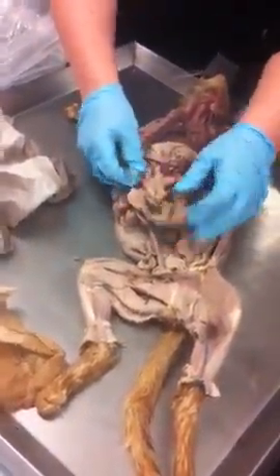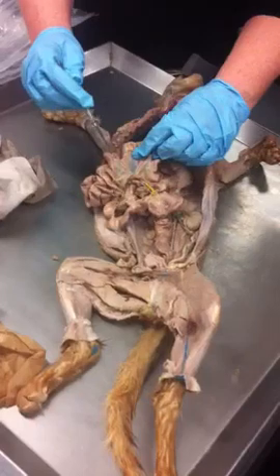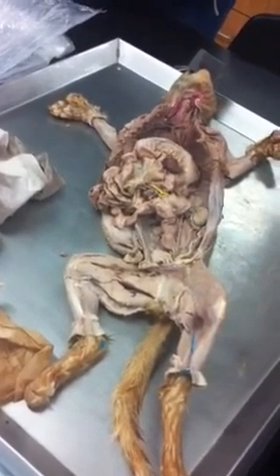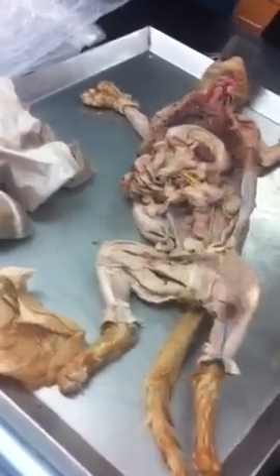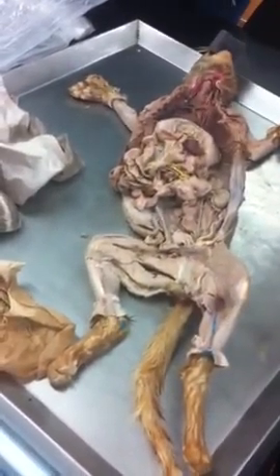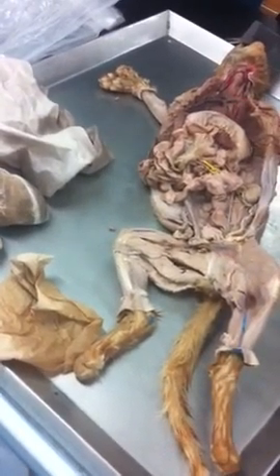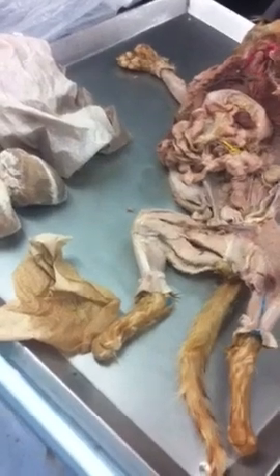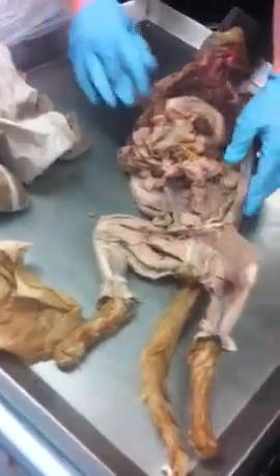And so those were all those arcading blood vessels running through there. And so those are all by region. There's not just one ileal artery and vein, not just one. So the 4 branches coming off of the superior mesenteric are the iliocolic, the midcolic, and then the intestinal arteries, of course, and then the veins.